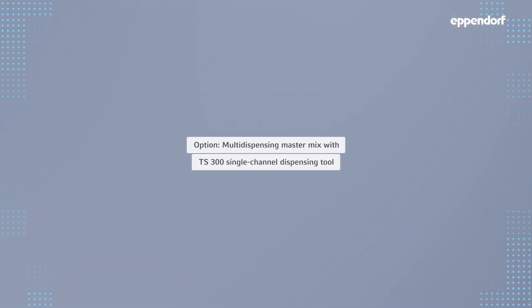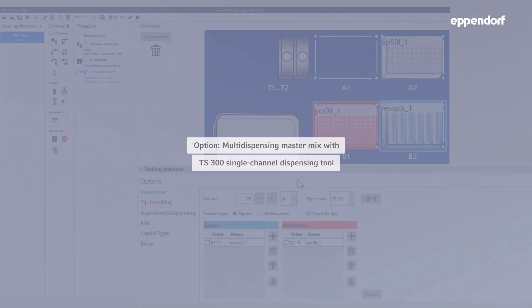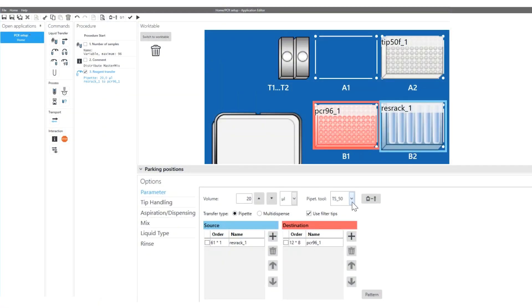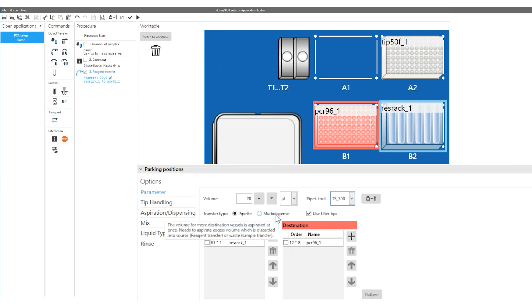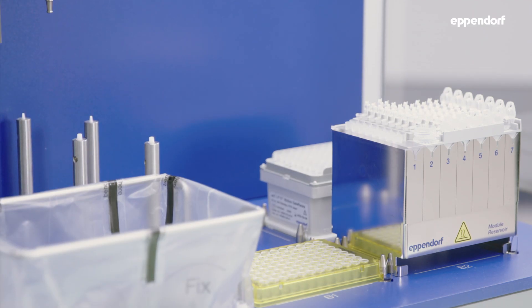To speed up the distribution of the master mix, you have the option to use a single channel 300 microliter tool with multi-dispense mode. You can easily adapt your previously defined protocol just by changing the pipetting tool and transfer type in the liquid transfer command.